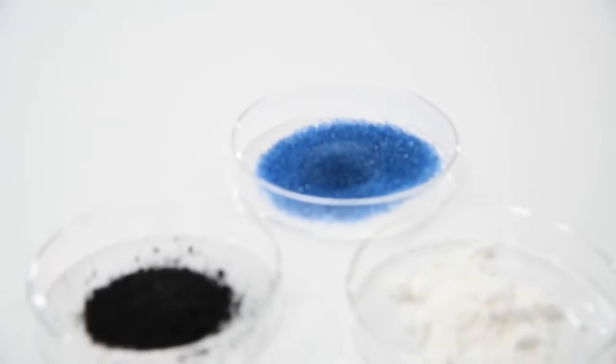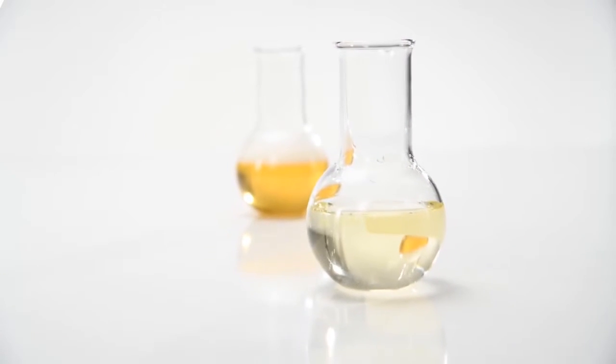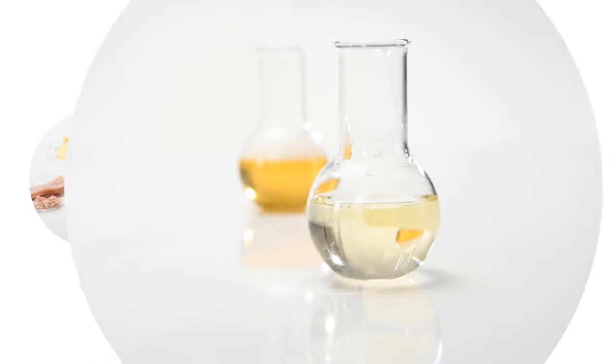The Sonopulse range can also be used to de-agglomerate the finest powders made of graphite and other carbon compounds, and to degas carbonated beverage samples, all in a matter of seconds for purposes of analysis.